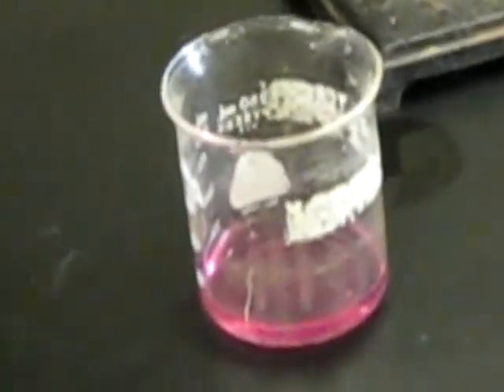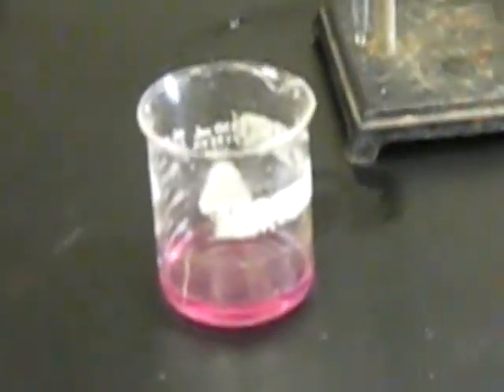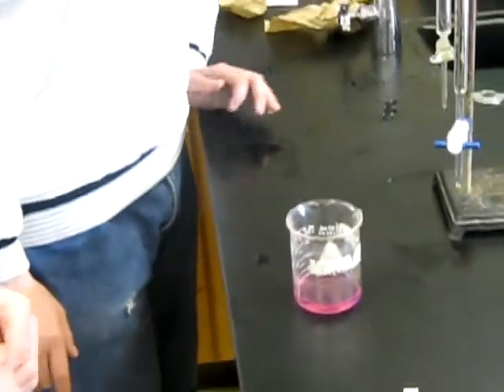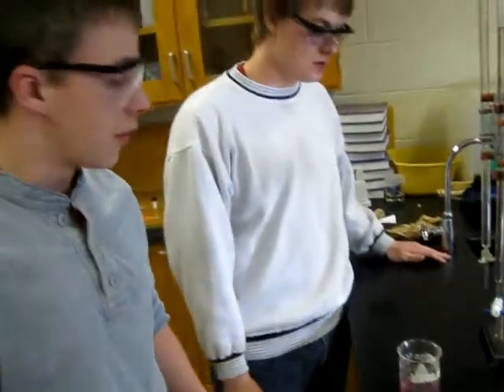So what we're going to do now is just stop adding the base and take our reading off of the burette. And it's looking to be about 14.7 milliliters of the base. Now what we do with that number is we take it back to our equation, molarity of acid times volume of acid equals molarity of base times the volume of base, and we can then solve for the molarity of acid.